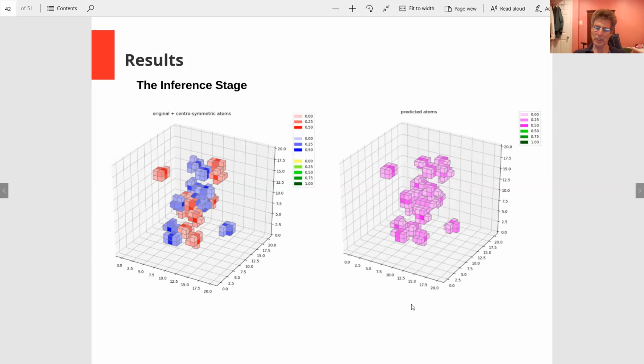And that's what you're seeing here. And I'm calculating a Patterson map from either one of those, the blue or the red, and putting that on the neural network input. Then we basically just see what output the network generates given a Patterson map that wasn't in the training set.